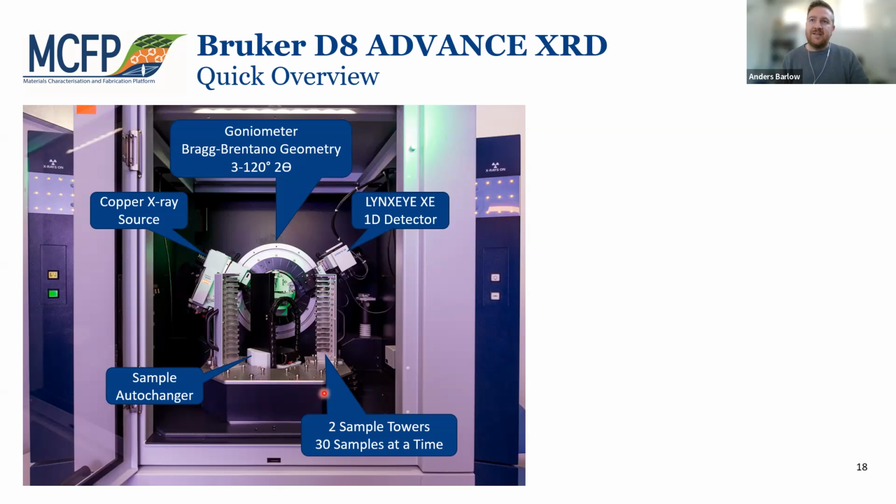So when you are using these instruments, either of them, really try to leverage the high throughput nature of these techniques. That is really what they are there for.